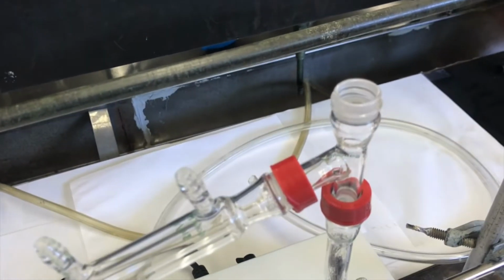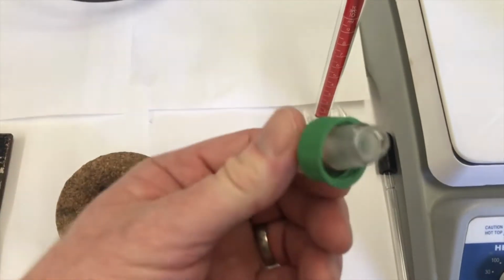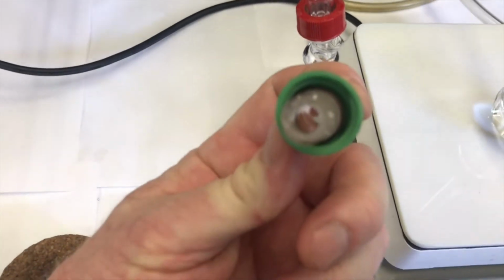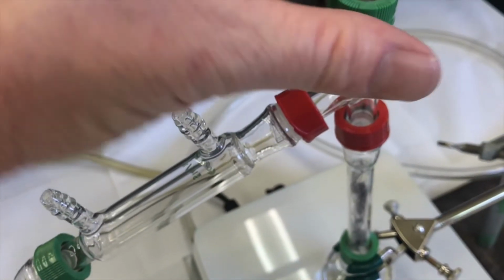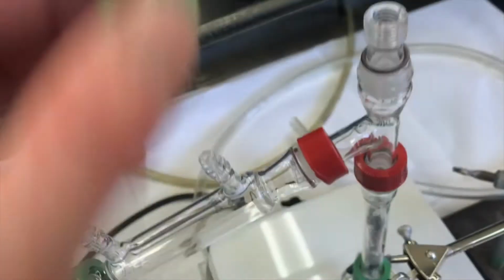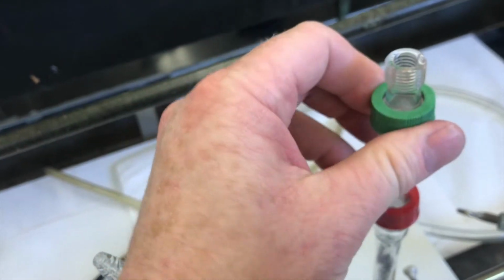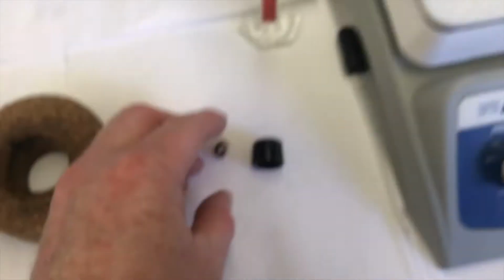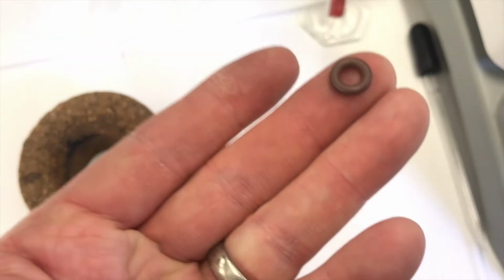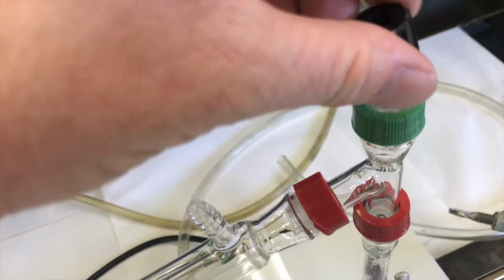And now finally on top, I need my thermometer adapter. And that starts with this guy, which has, again, one of those little brown O-rings in there. I stick it right on top. You can see there's that brown O-ring I was telling you about. When I tighten this, it pinches down the O-ring and squeezes everything together. And then the way this next part works, I got another rubber O-ring, a little stronger one. I put that on first, like that, and then I put this cap over it.